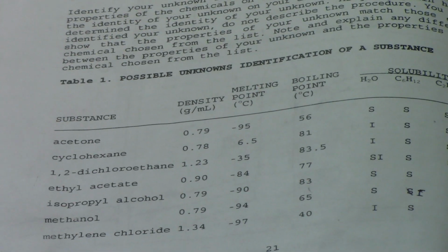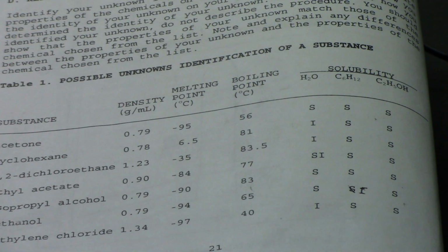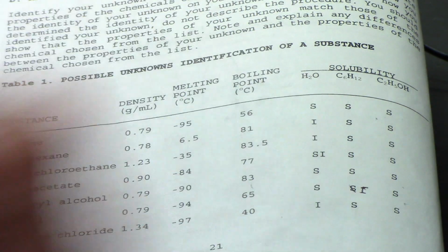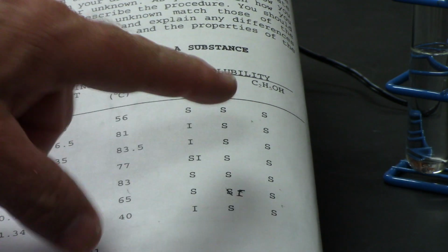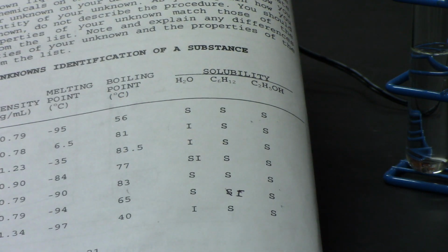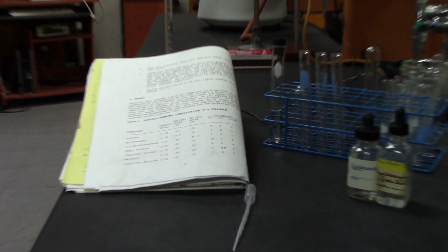Okay. So there's my list of the possible things it's going to be. And if you notice in this list, it has the density of each substance, the melting point, which we're not going to be dealing with here, the boiling point, and the solubility. The first thing we're going to do is solubility, and we're going to look at it to see if our substance is soluble in water, cyclohexane, and ethyl alcohol or ethanol. So we'll do that first. Okay, so let's show you how I'm going to do that.